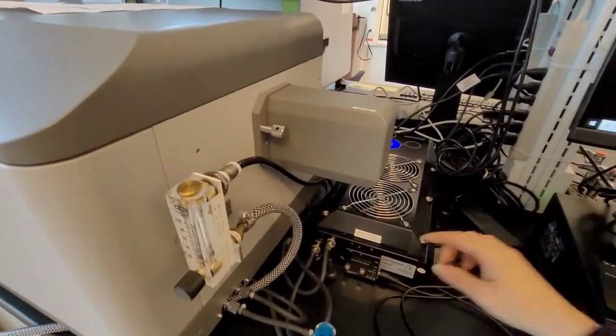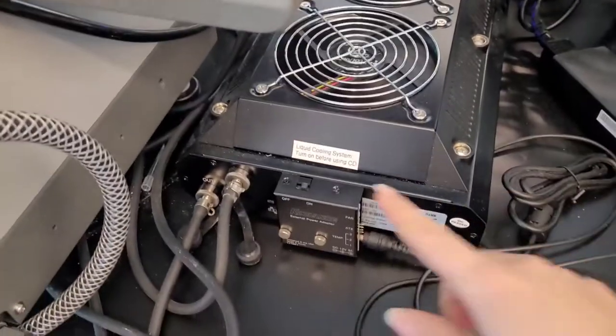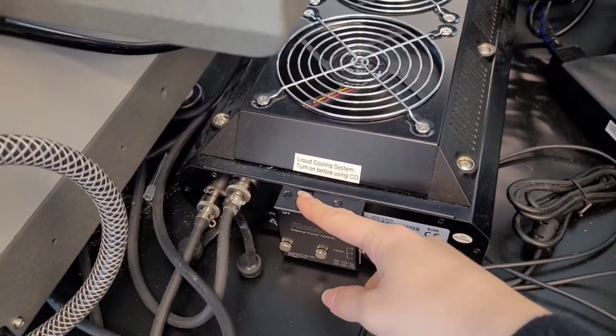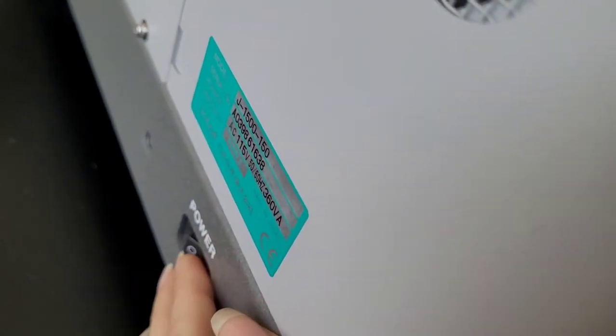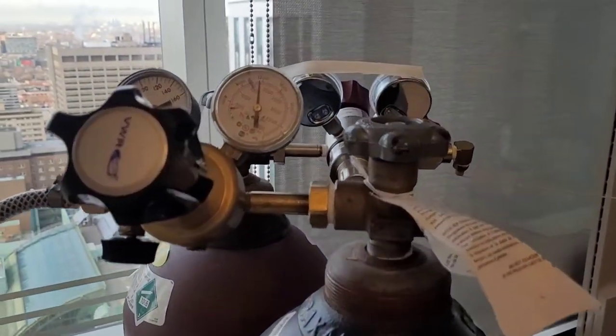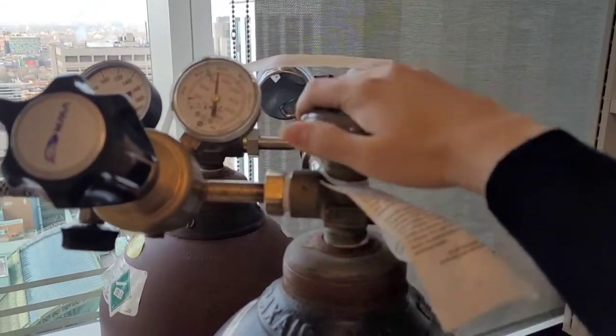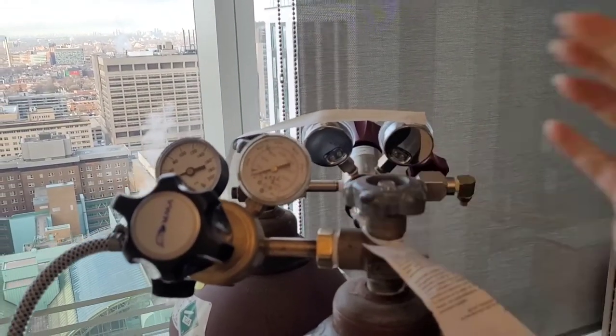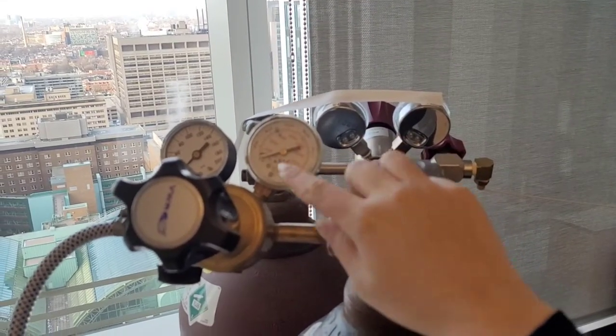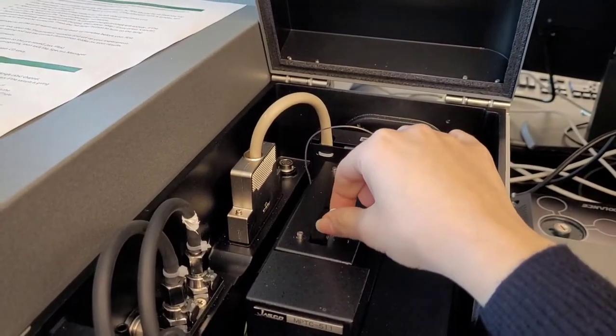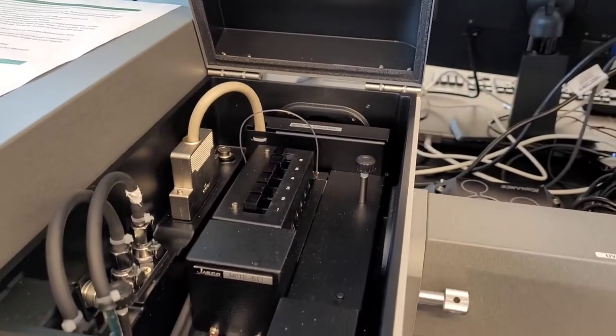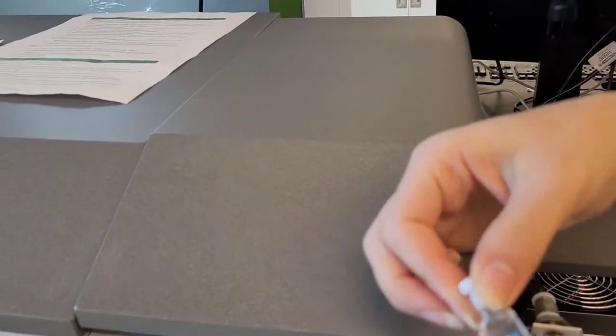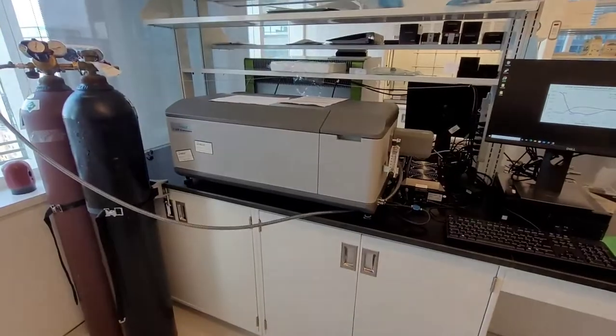So first, I'm going to turn off the water, the liquid cooling system. Then, turn off the instrument. And finally, turn off the nitrogen. And you want to make sure that it will go back down. And also, remove your sample.